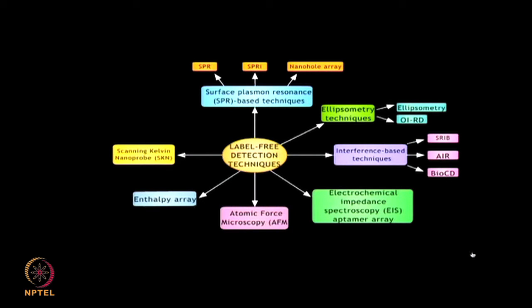Scanning Kelvin nanoprobe, SKN, a non-contact technique that does not require a specialized vacuum or fluid cell. SKN detects regional variations in surface potential across the substrate of interest caused due to molecular interactions.